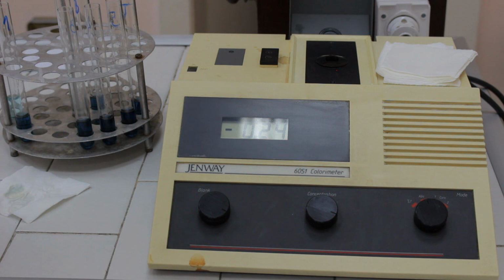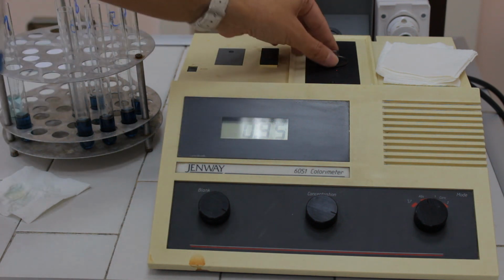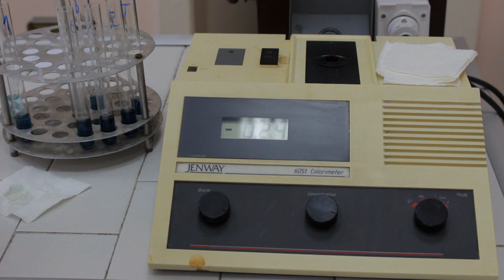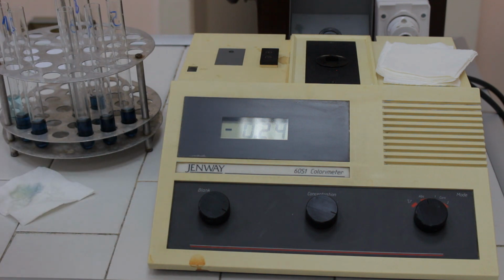Repeat the procedure with the standard solution number 2 in the same manner. And continue till the end, which means read of absorbance of our unknown or test solution.